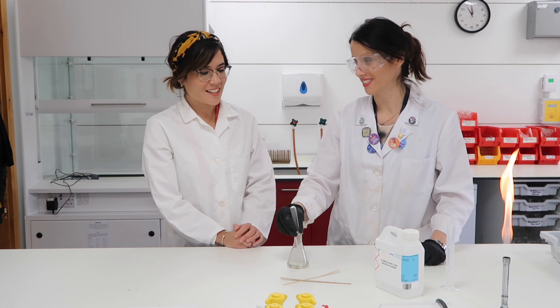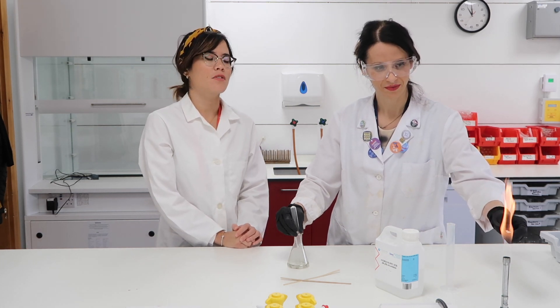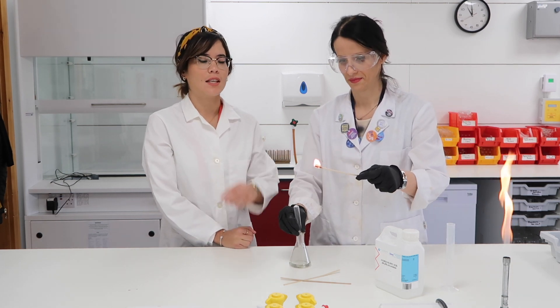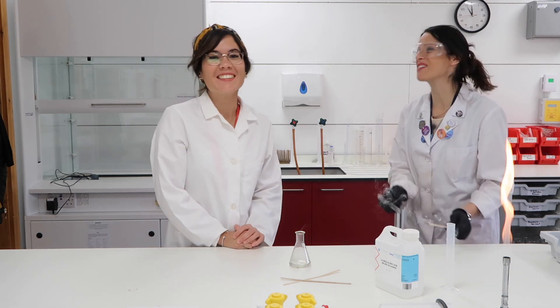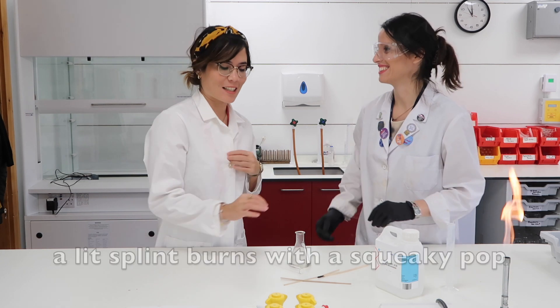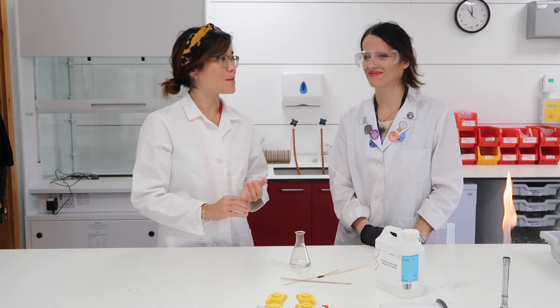Shall we try? Cool, let's see. Crucially, the test for hydrogen involves a lit splint — you must say that it's lit — as you can see it has a flame. That was fantastic, we had a squeaky pop! A squeaky pop is indicative of hydrogen gas being produced.